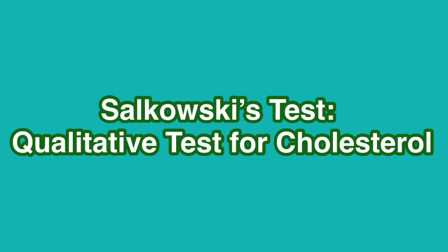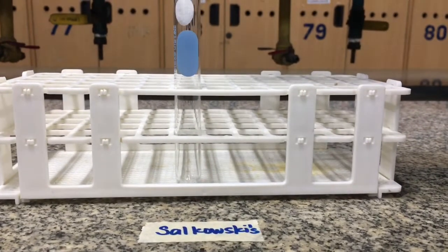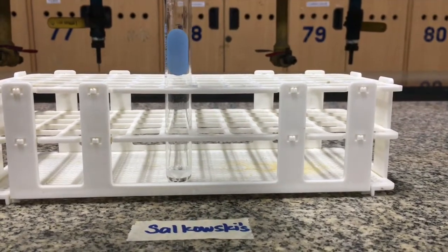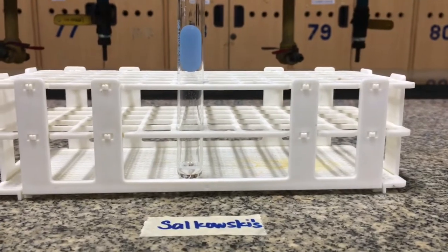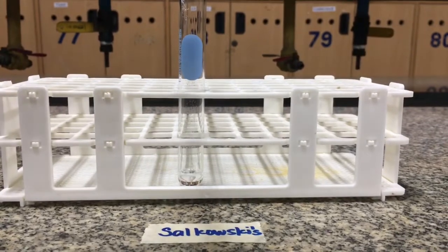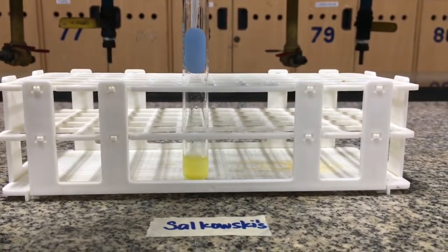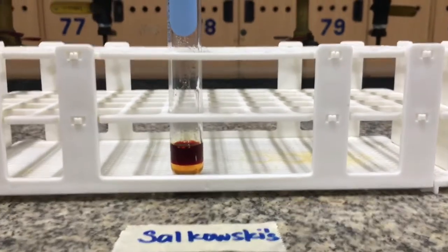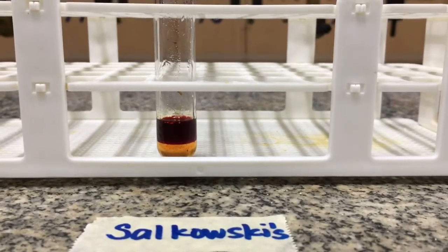The last 2 tests for this experiment are used to test for cholesterol. The first test is the Salkowski's test, which is a qualitative test for cholesterol. To do this, add a small amount of cholesterol in the test tube, and then dissolve the cholesterol in chloroform. After that, add 2 drops of concentrated sulfuric acid into the solution. Upon addition, a cherry red coloration was observed, which indicates a positive result for the presence of cholesterol.